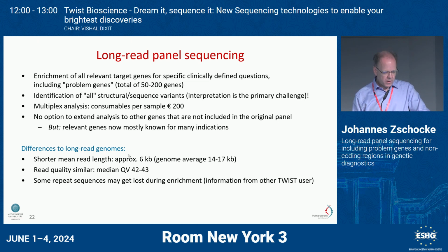The read length is about 6 to 7 kb. In our hands, the genome is 14 to 17, so it's not that big, I would say. Read quality is excellent, and we have some information that some repeat sequences get lost during enrichment, and it's work in progress.